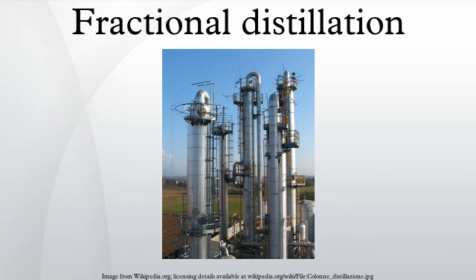Discussion. As an example, consider the distillation of a mixture of water and ethanol. Ethanol boils at 78.4 degrees Celsius while water boils at 100 degrees Celsius. So, by heating the mixture, the most volatile component will concentrate to a greater degree in the vapor leaving the liquid.